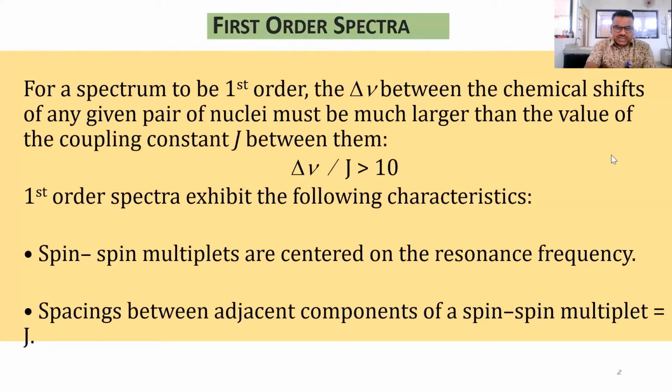Another important thing that I want to mention, when we consider CH3, CH2, if I ask what is the splitting pattern of CH3, definitely the neighbor is CH2. So n is equal to 2. So 2 plus 1 is equal to 3. Therefore it shows a triplet. So CH3 shows the triplet. And this is the splitting pattern of that particular molecule according to the resonance frequency. So this is the normal one. Whatever things we are observing generally, all things are showing the first order spectra.